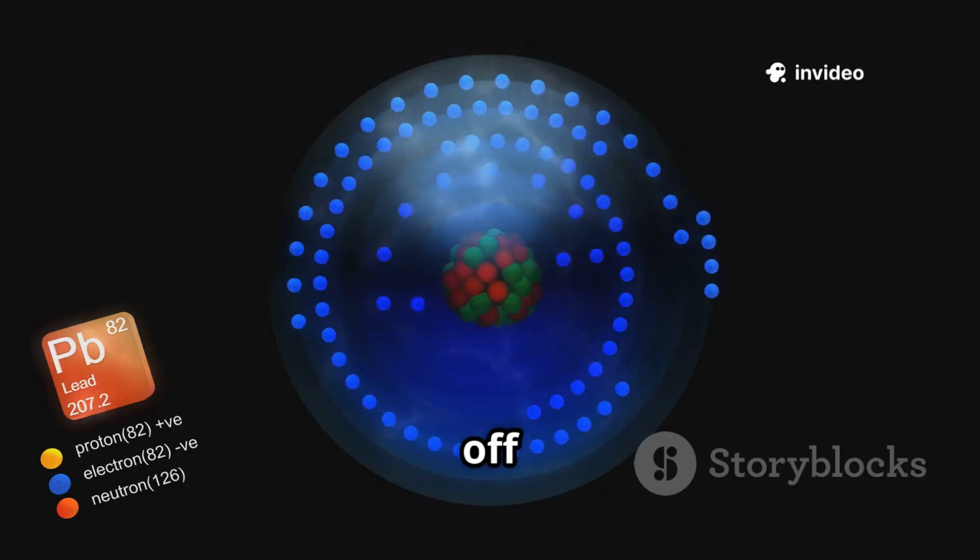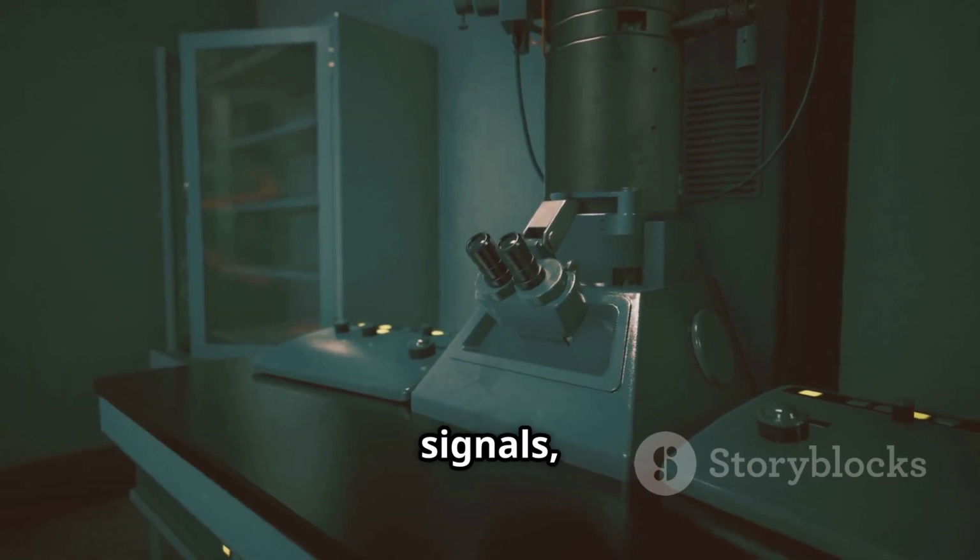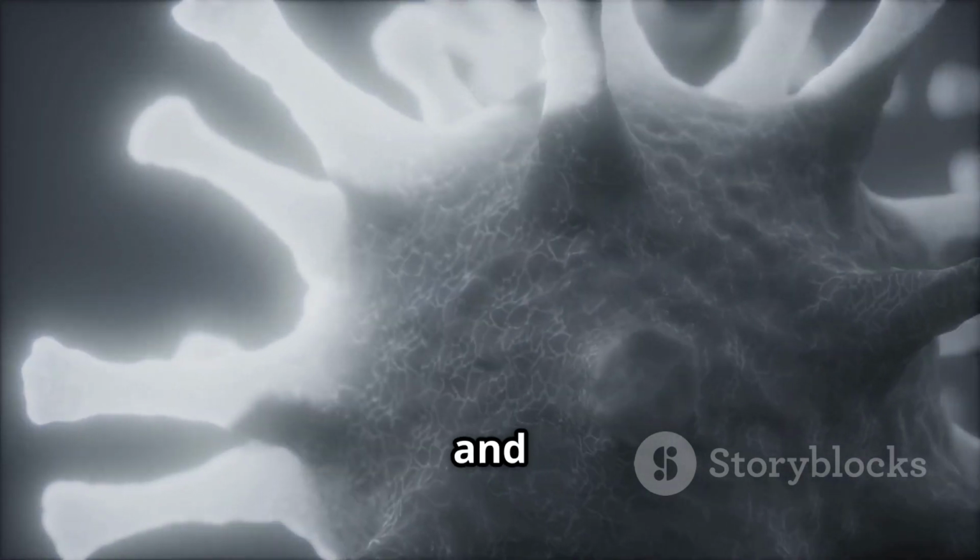Backscattered electrons bounce off heavier atoms, making those areas appear brighter, great for spotting different materials. Detectors collect these signals, creating images that show both structure and composition.